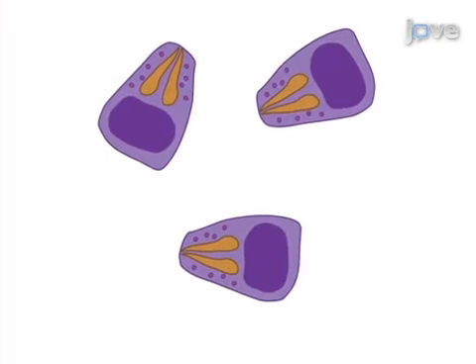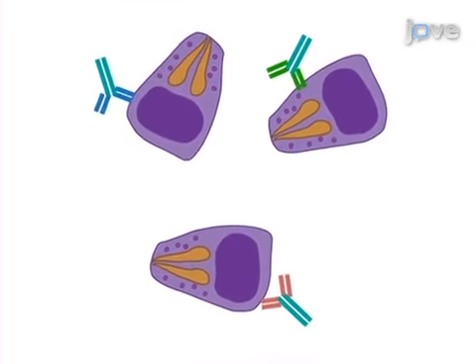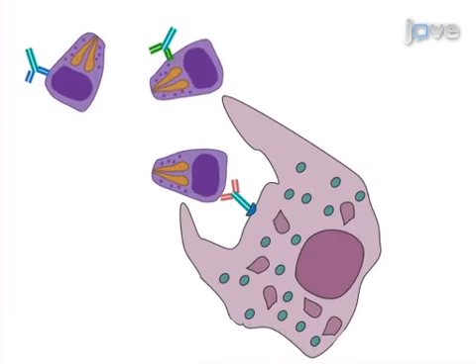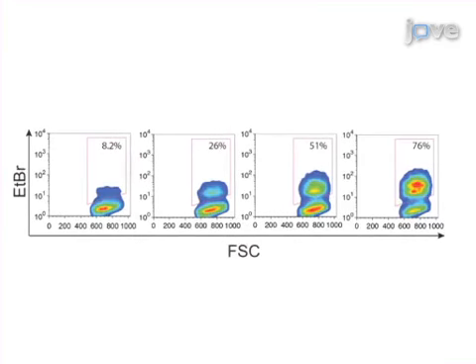In the final step, the Merozoites are incubated with various human plasma samples and THP1 human monocytic cells. Ultimately, the opsonization of the Merozoites by the different human plasma samples can be differentiated by flow cytometry.